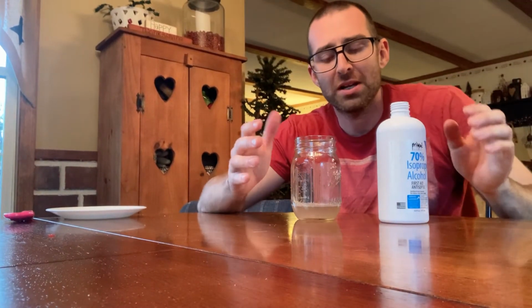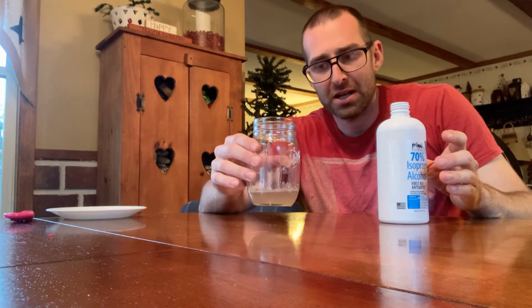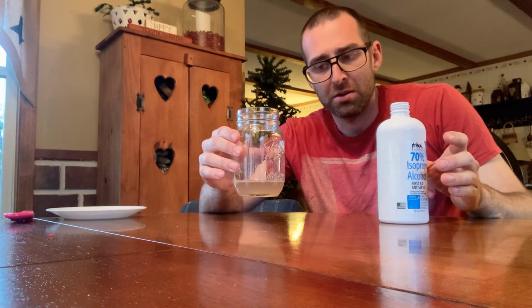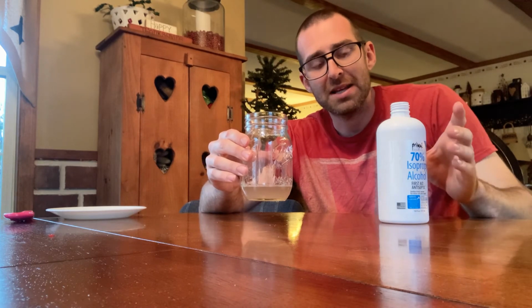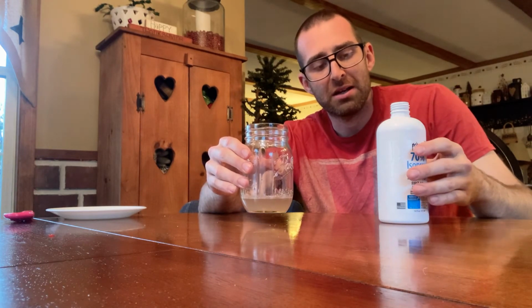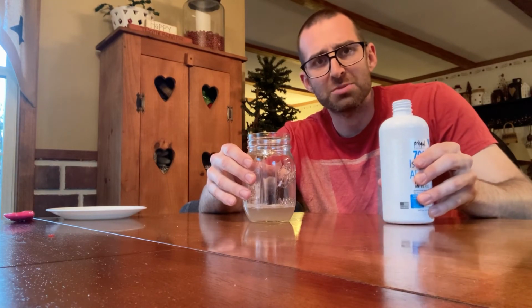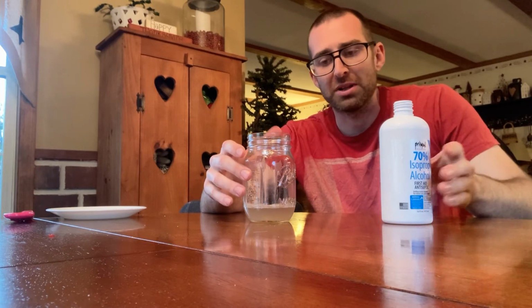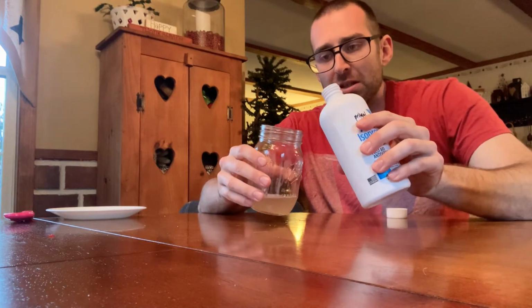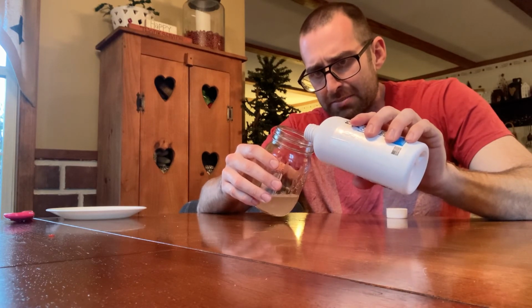Okay, so we had a couple mishaps. But at the end, you should have your banana liquid at the bottom of your glass. And the last step is to add about an inch of alcohol. Now, this is isopropyl alcohol, and it should be cold. So I've had it in the freezer for a couple hours. And you want to add it slowly so it forms a nice layer on the top.